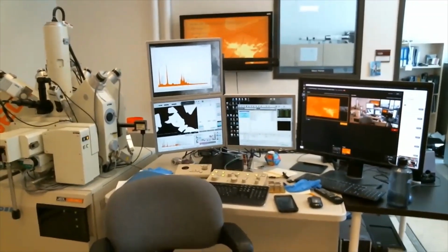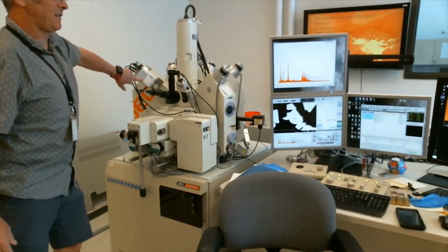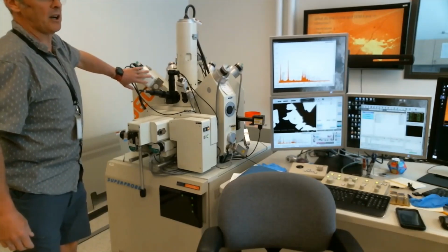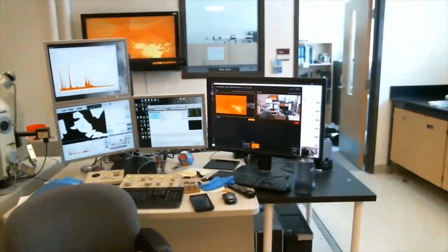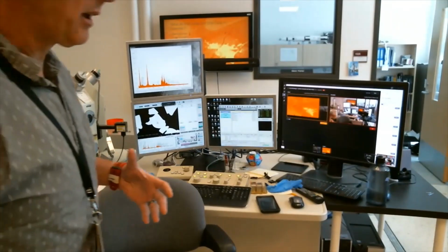I'll show you. Yeah, you can see that. This is a different type of X-ray detector. We have two different X-ray detectors on the probe, and I'll talk a bit more about those later. So from that perspective, they're very similar machines. They've both been optimized for certain things. As I said, the probe is optimized for quantitative data, and the SEM is actually optimized for ease of use. This is a very great machine to use.